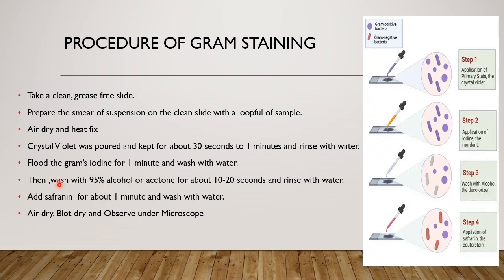Why do we wash here? It is to remove the excess stain. After adding crystal violet, why did we rinse it with water? In case there is any extra stain, by washing, the extra stain will get removed. Again, after iodine, we wash to remove the excess iodine which is present.